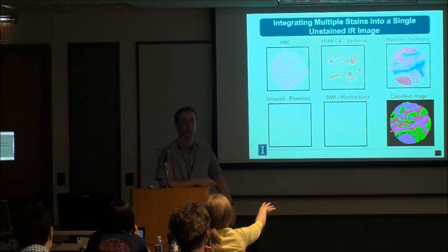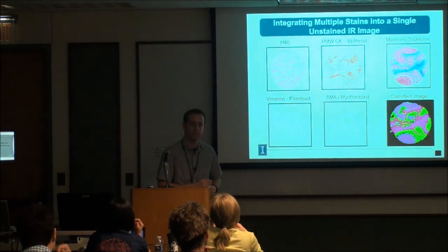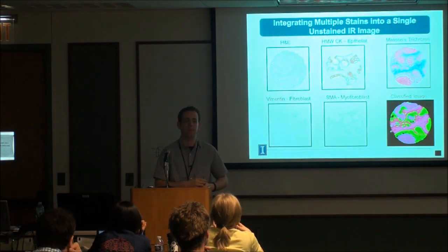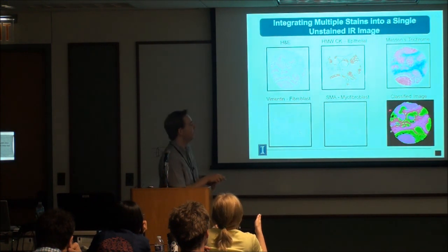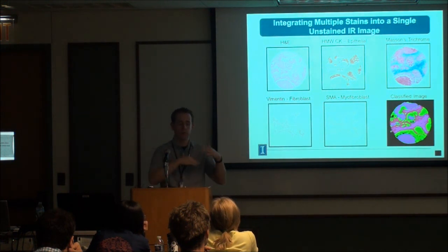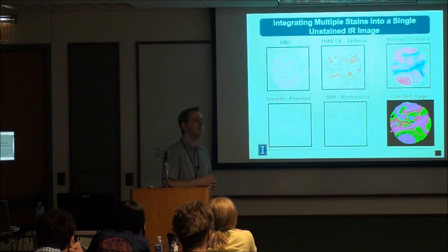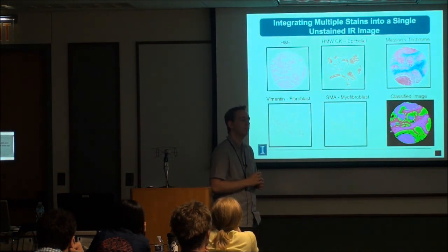This is the infrared image. Yes, this is the classified infrared image, the processed image. Is it an HCA map? Oh, this is Bayesian. Yes. The Bayesian basically derives these metrics, and then it will give you values, and it will predict what class a pixel belongs to, and color code.